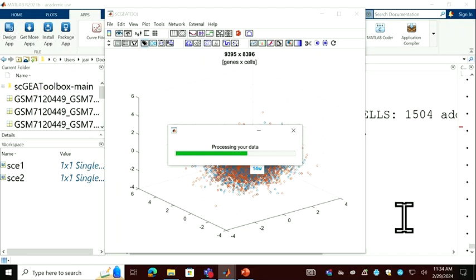I just do them together. If they separate into different clusters, that's fine, because they form 2 different conditions. Maybe they are separable, but some cell types will still be in the same cluster. That's fine.